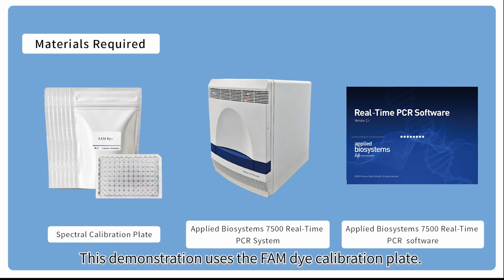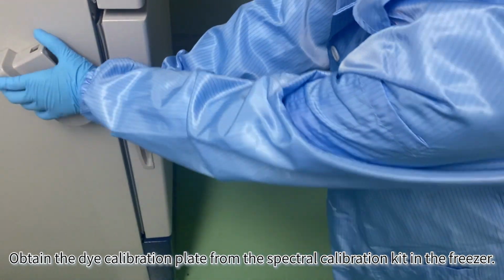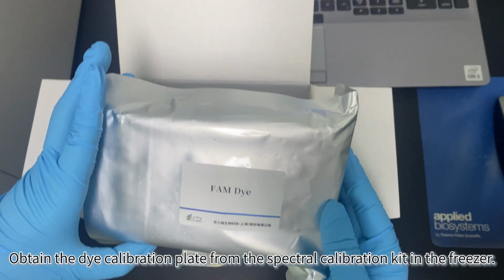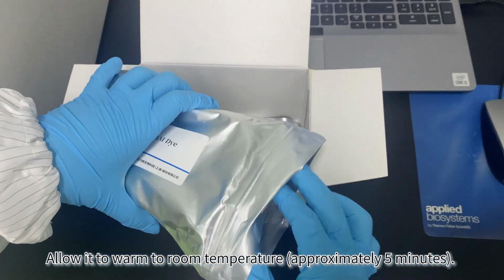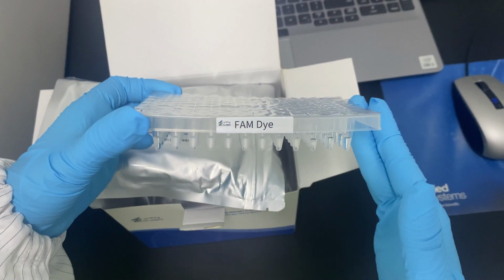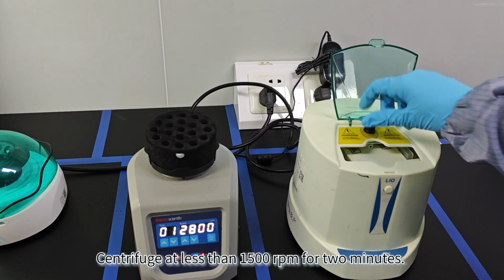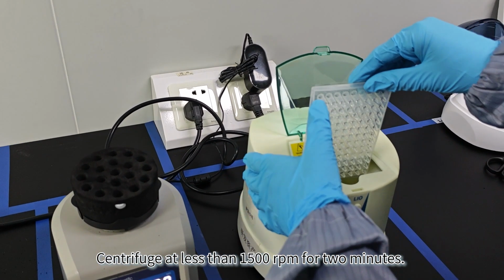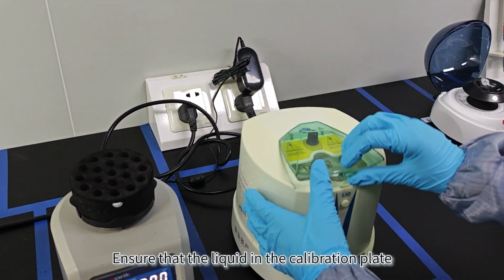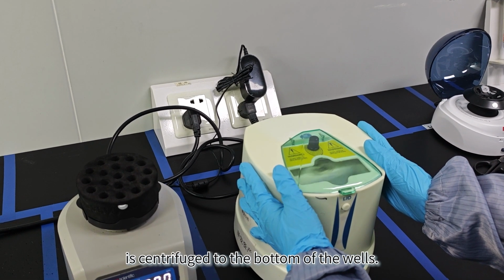This demonstration uses the FAM dye calibration plate. Obtain the dye calibration plate from the Spectral Calibration Kit in the freezer. Allow it to warm to room temperature. Open the packaging. Remove the calibration plate. Vortex for 5 seconds to mix thoroughly. Centrifuge at less than 1,500 revolutions per minute for 2 minutes. Ensure that the liquid in the calibration plate is centrifuged to the bottom of the wells.